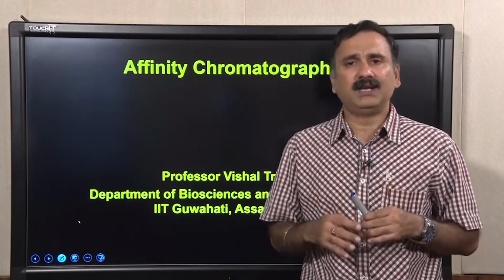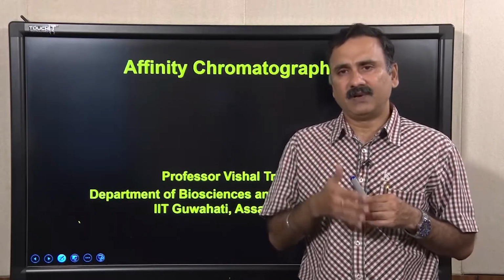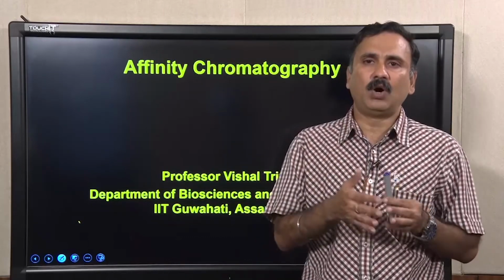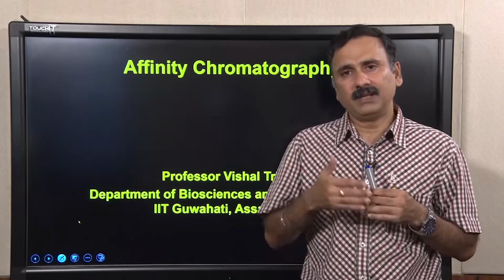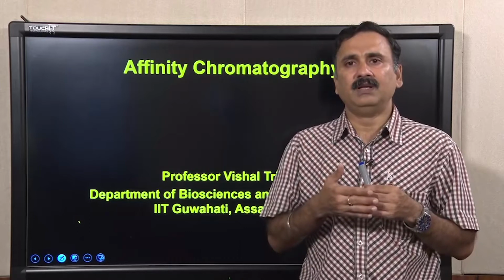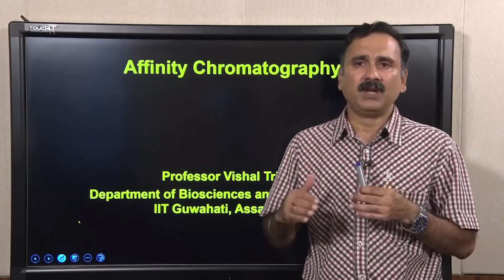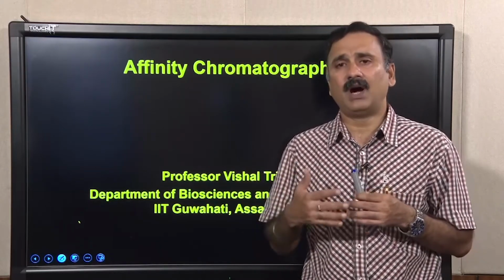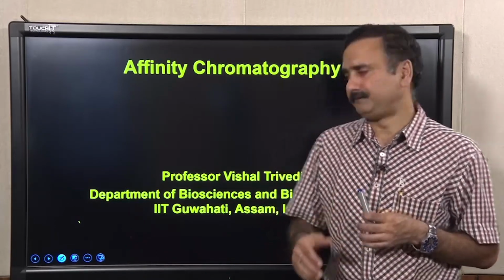So, in today's lecture we are going to discuss different aspects related to the generation of the receptor or the ligand, how you can couple them to the matrix with the help of the different types of chemistry developed for this, and how you can utilize them for purification.